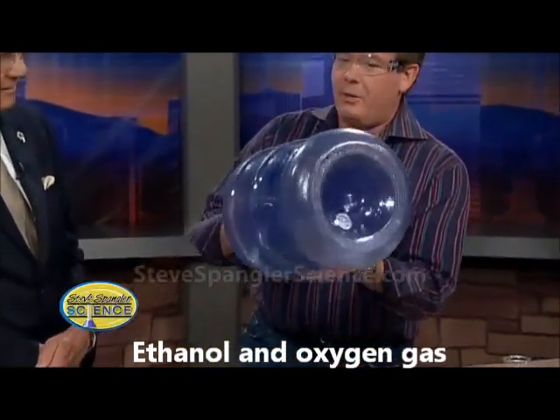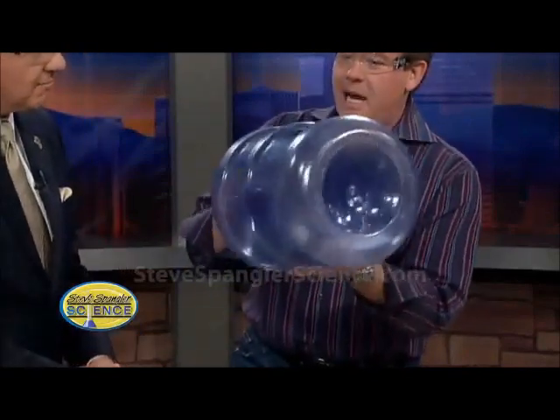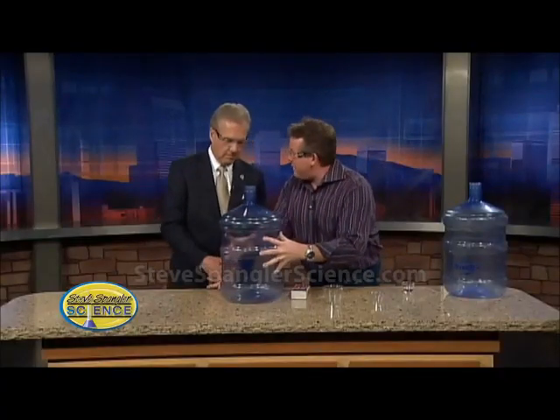In just a second, we're going to light this on fire. We're going to create some heat that's inside, and as soon as that heat is inside it's going to push all those air molecules out. Then we're going to make kind of a one-way valve — I'll put my hand on top of it and we're going to see the effects of the air pushing around us on this bottle.